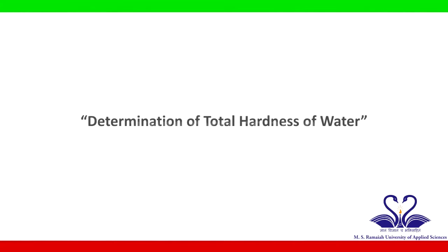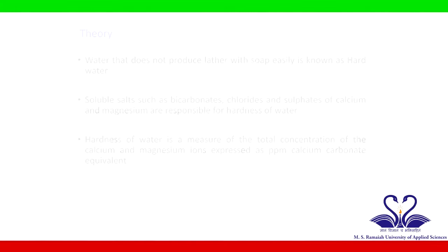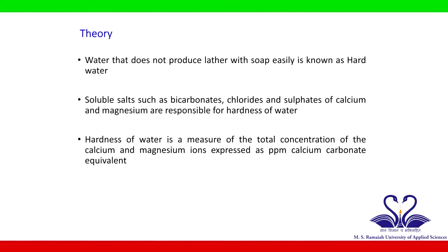Hi students, let us discuss the determination of total hardness of water. Before performing, let us understand what is hard water and its root causes. Water which does not produce lather with soap easily is known as hard water.